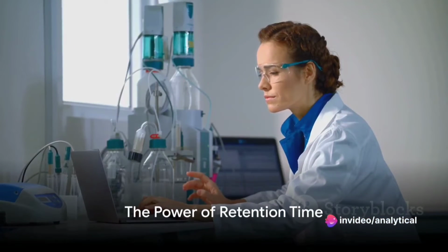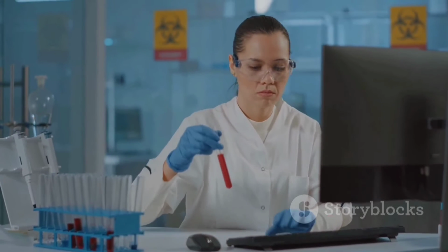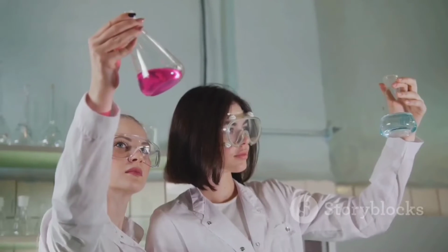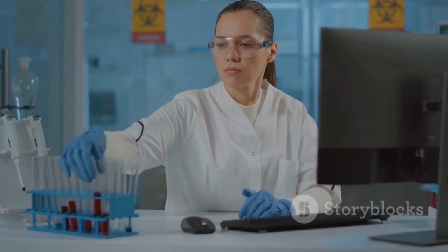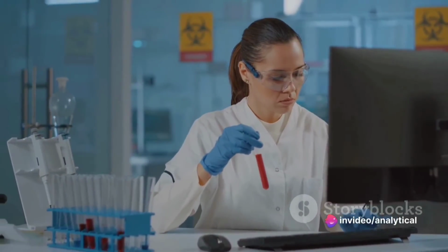Retention time is more than just a race, though. It's a powerful tool to identify and quantify the compounds in a sample. By analyzing the retention times, scientists can tell which compounds are present in a mixture and in what quantities.